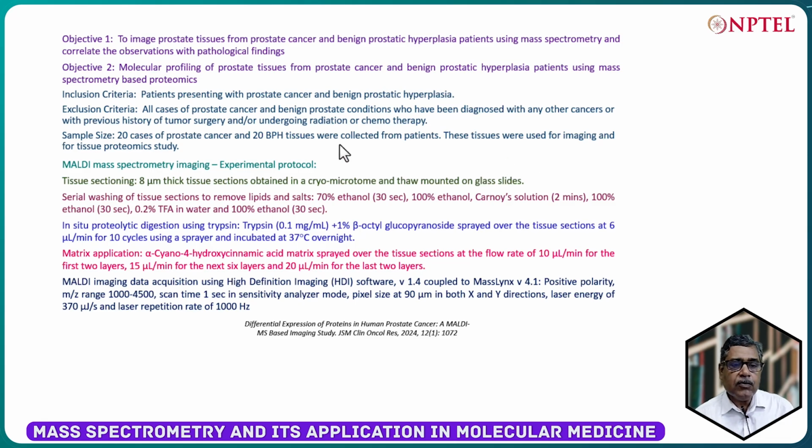First and foremost is collection of the tissues and then fresh freezing. We will be talking about fresh frozen tissue sections, not formalin fixed paraffin embedded tissues.